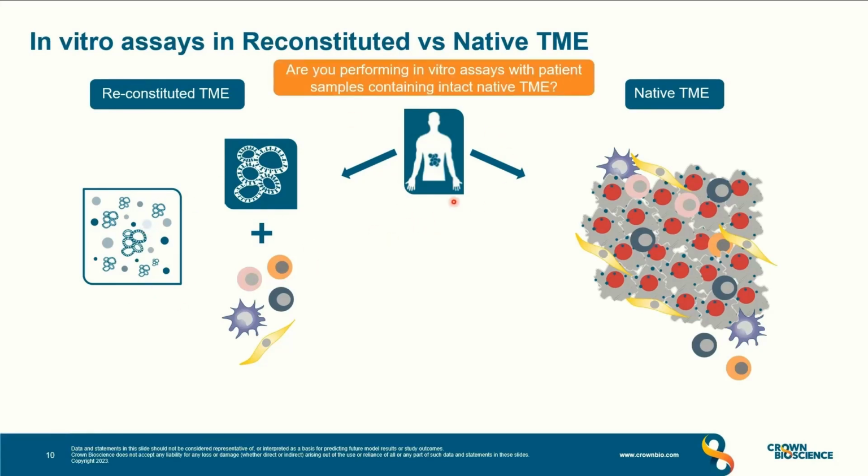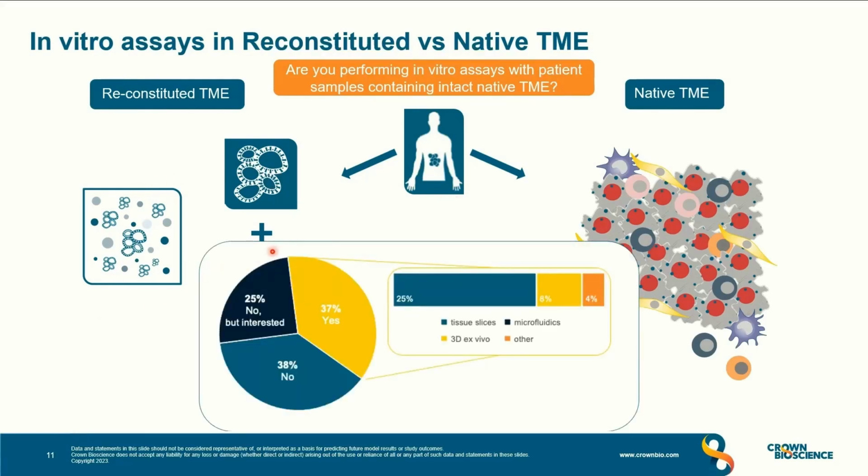In a previous webinar, we asked you a poll question about which types of assays you are performing with native TME. Here are the responses that we've got from you. 37% of the responders have been using the native TME assays in the past, with the majority focusing on tissue slices and 3D ex vivo assays. Today, I will show you some examples of such assays from the literature, as well as from our own research.